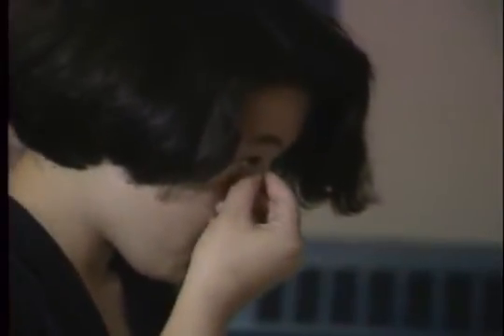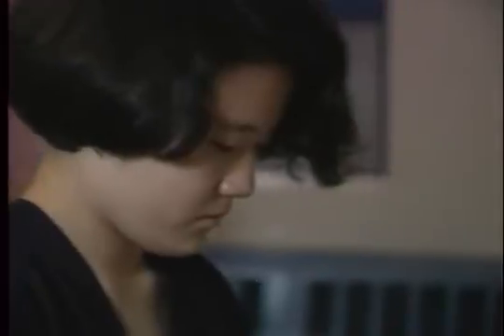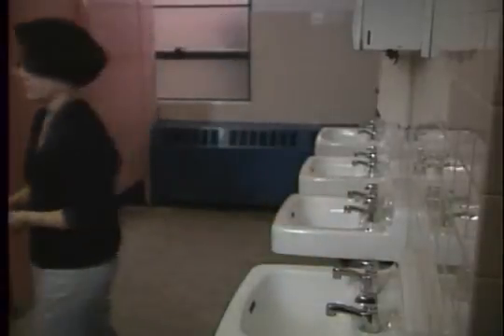Your eyes are the easiest to hurt and the most important to protect. Don't wear contact lenses in lab. They may trap chemical vapors against your eyes. If that happens, your eyelids may go into spasms that make it impossible to remove the lenses and wash out the chemical.